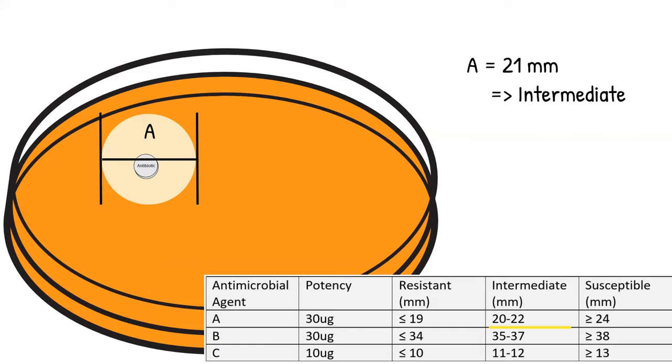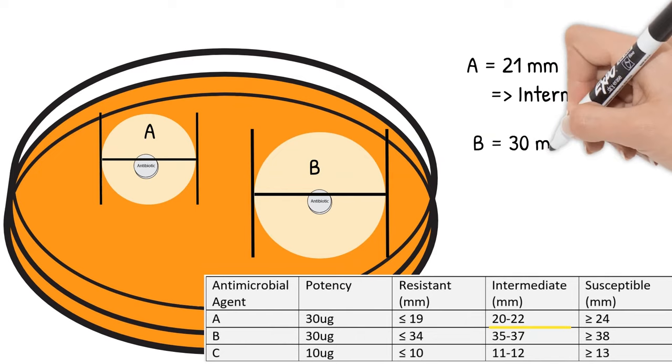Next, Disc B. It looks like it will be susceptible because the zone is quite large. However, that is a mistake. You cannot just look at it. You have to measure the zone of inhibition to know if the organism is resistant, intermediate, or susceptible.